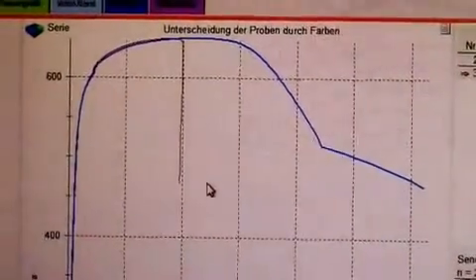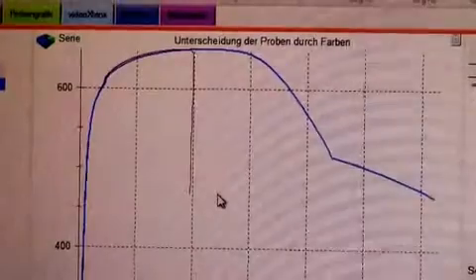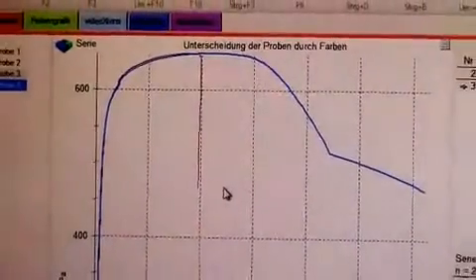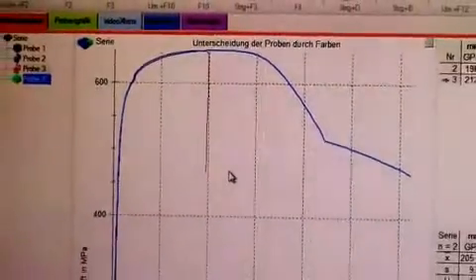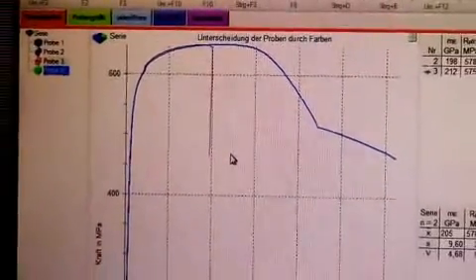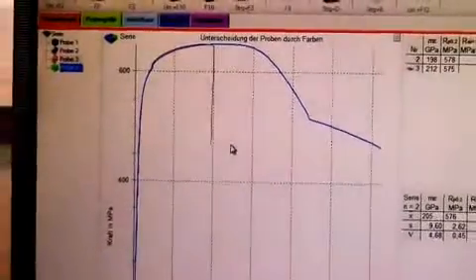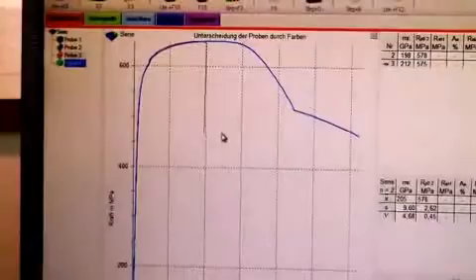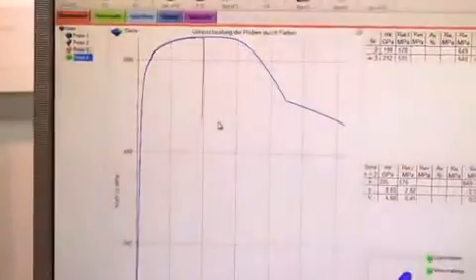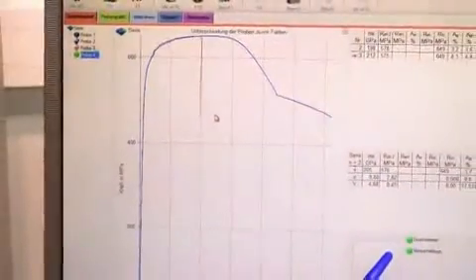Now you can see the big difference between the first and the second strain evaluation and so the braking strain can be correctly determined.